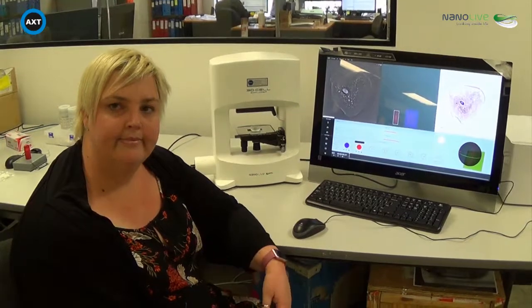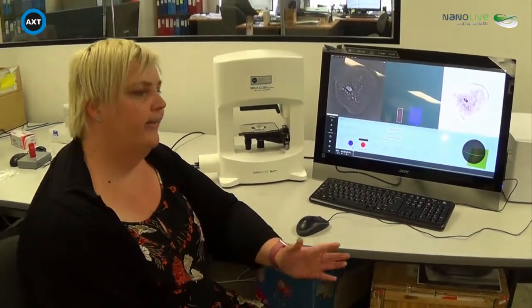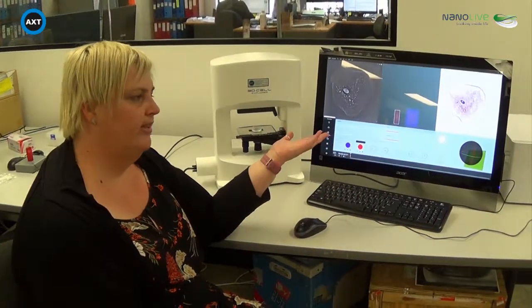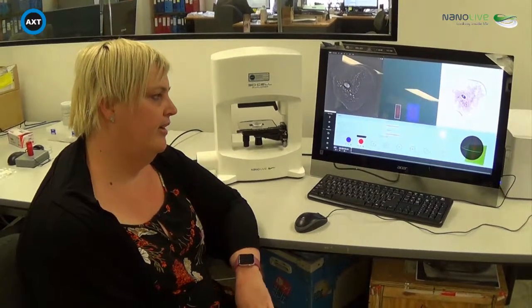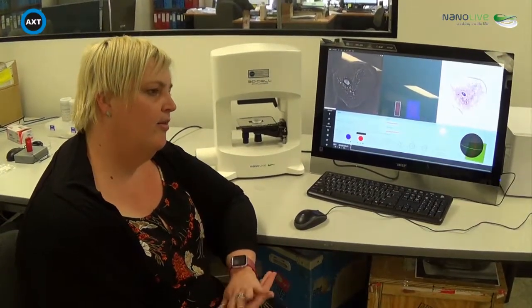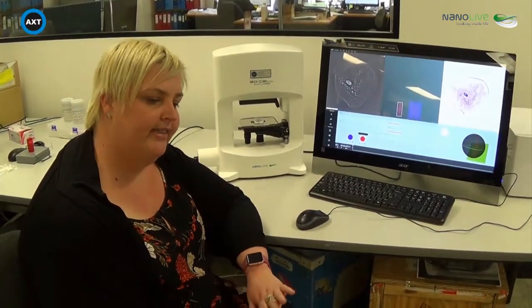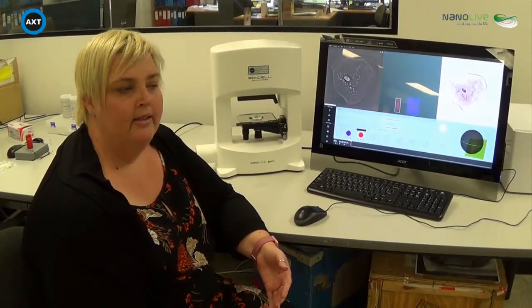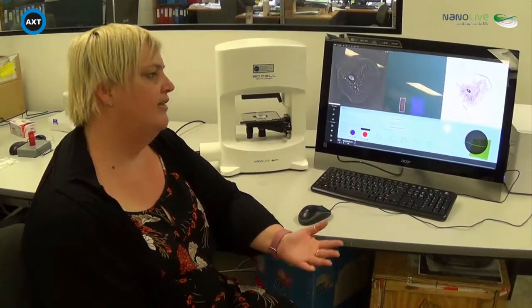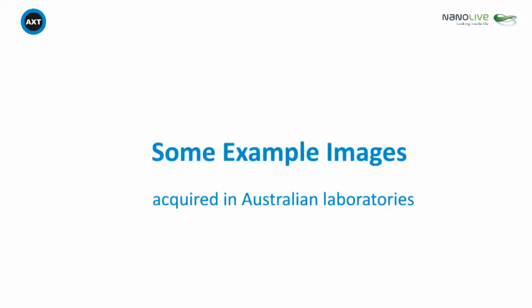And so what's an example of some applications for the 3D Cell Explorer? Okay, so we've done tons of applications. This is a very simple cheek cell that's actually a swab from your mouth, but within the labs we've done a lot of samples that are breast cancer cells, we've done bacteria, we've done nematodes, nanoparticle uptake into cells, macrophages, lots and lots of different applications.